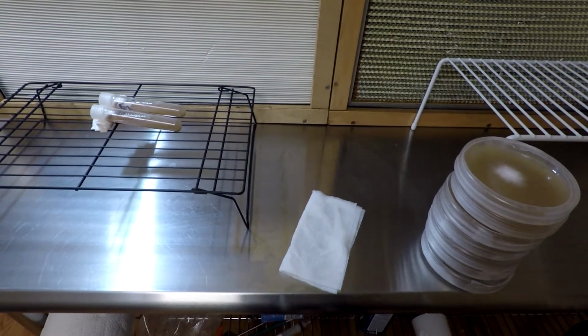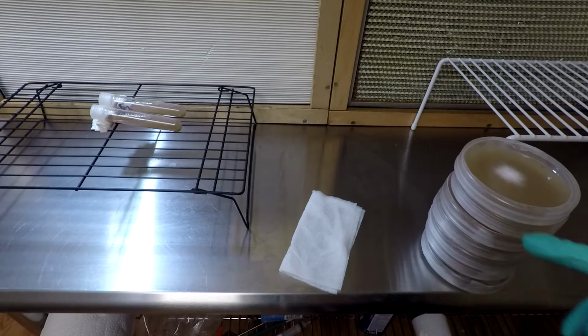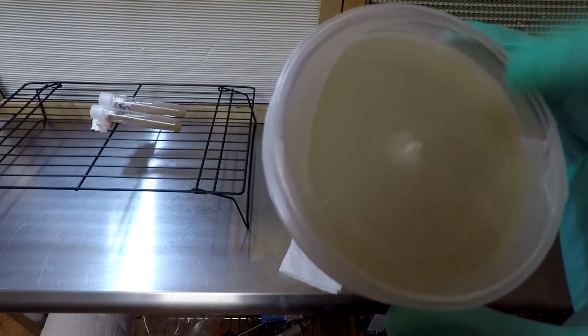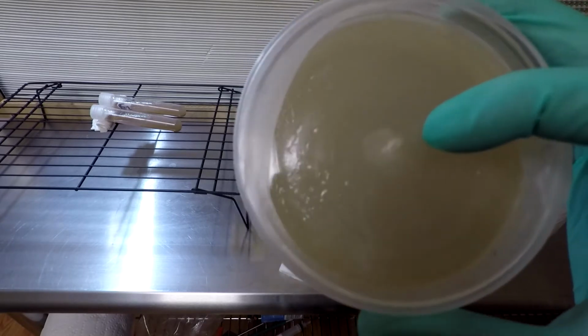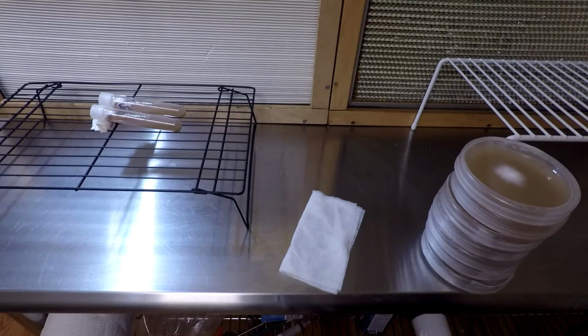I'm making up some slants for the king oyster culture that I've made from my own spores. And I have these 8 dishes, actually 7 dishes here. One of the dishes got contaminated. You can see how there's very little growth in the center, and then all that splotchiness around is either a bacteria or yeast in there. But that can be expected with a second transfer from spores.